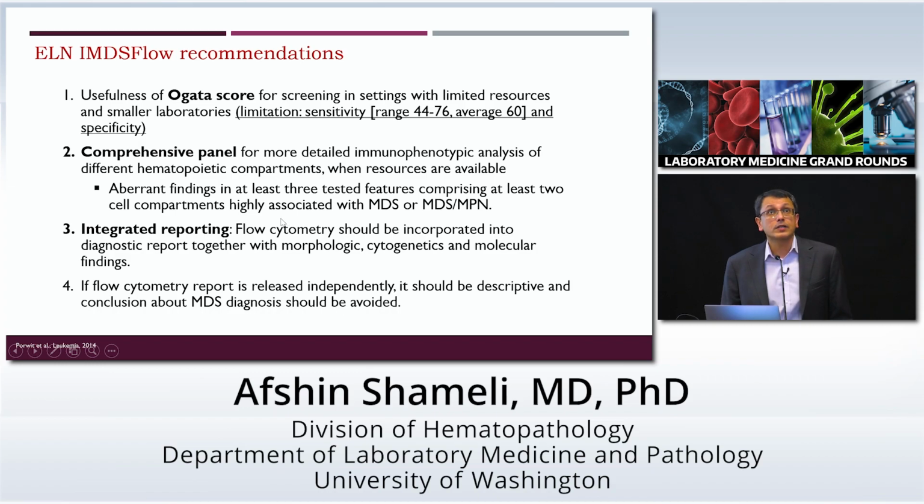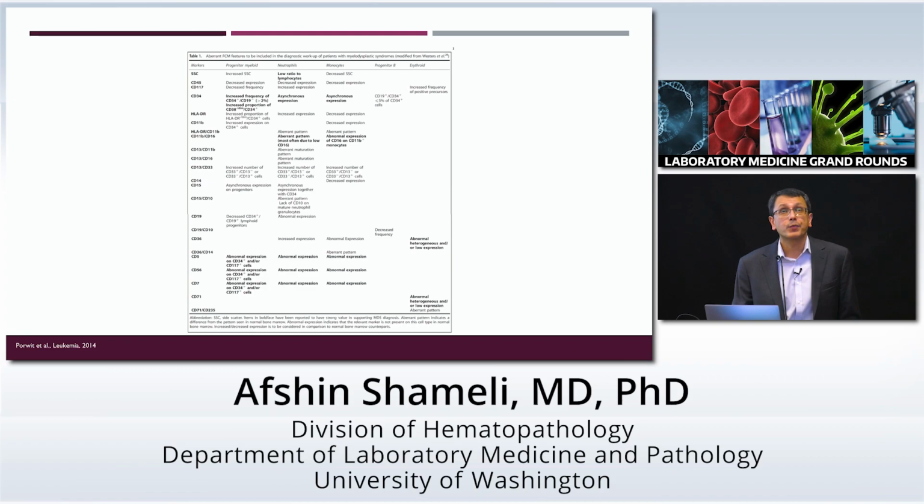They emphasize the importance of integrated reporting, meaning that flow cytometry should be incorporated into the diagnostic report together with morphologic, cytogenetic, and molecular findings. And if flow cytometry is reported independently, it should be descriptive, and conclusions about MDS diagnosis should be avoided.